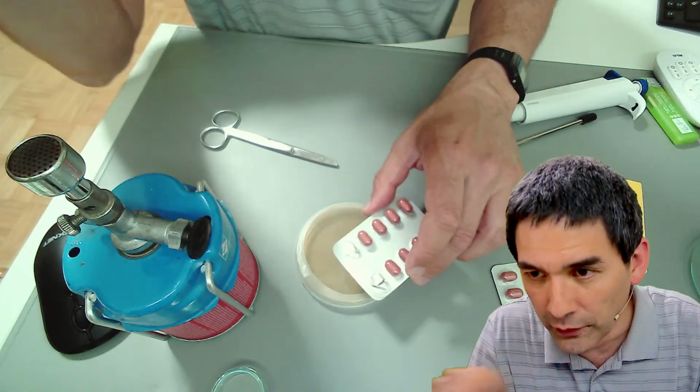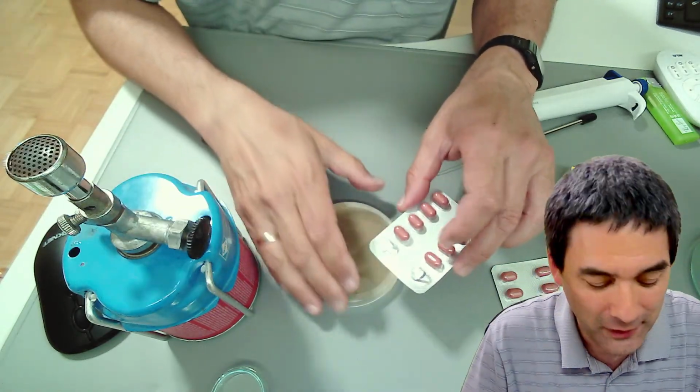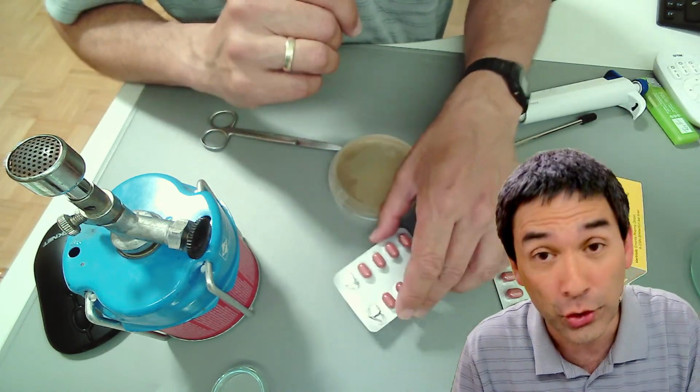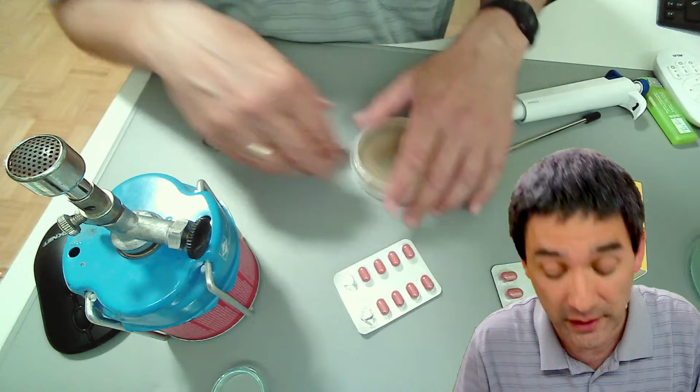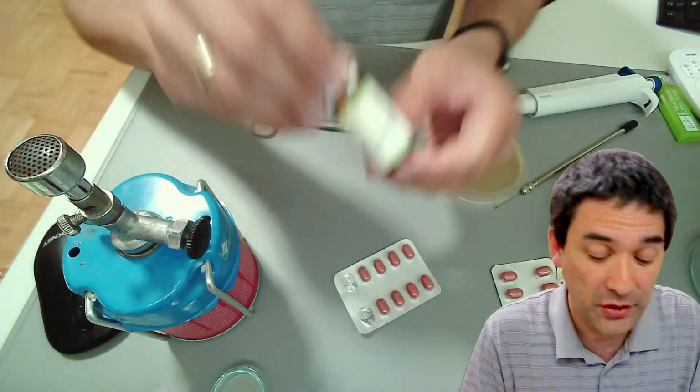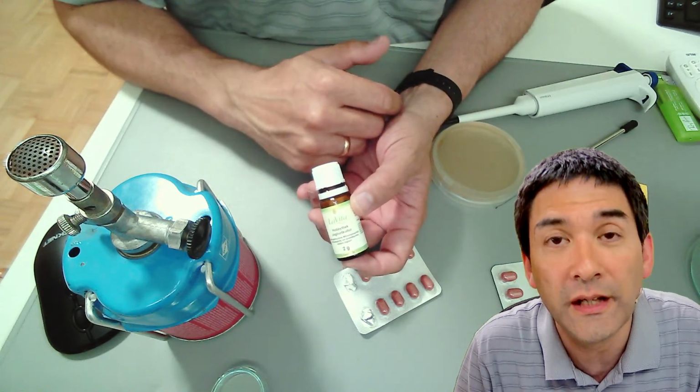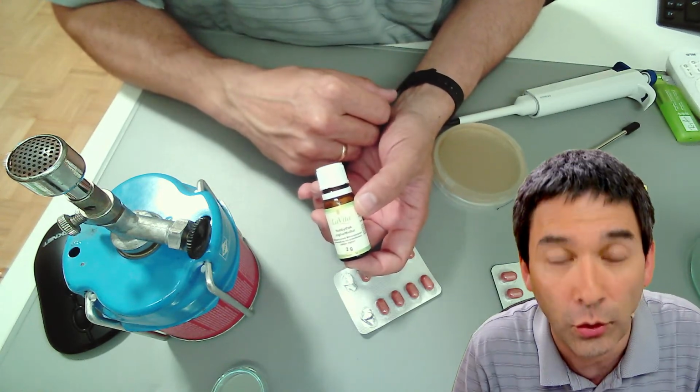I'm just looking over here into the comments. Some people say, "Wow, E. coli in the drugstore." Well, I'm going to show you two other sources of bacteria. I bought this one here as well. You know what this is? Yeah, these are freeze-dried bacteria that you can add to milk to make yogurt, homemade yogurt.